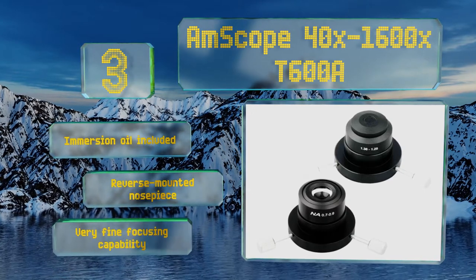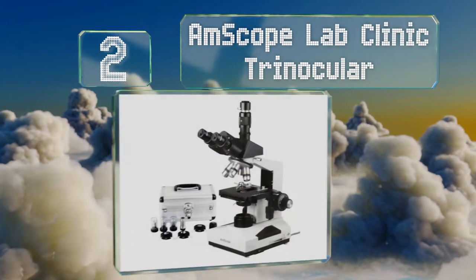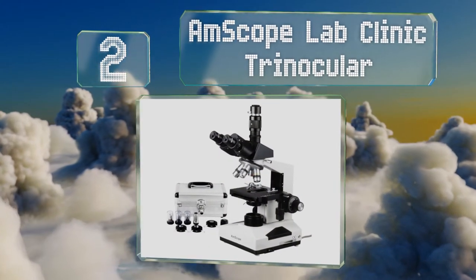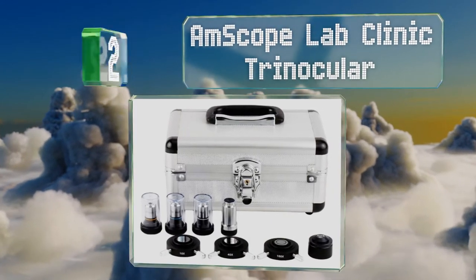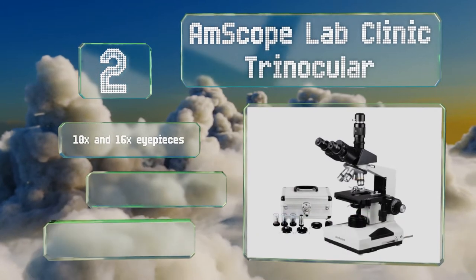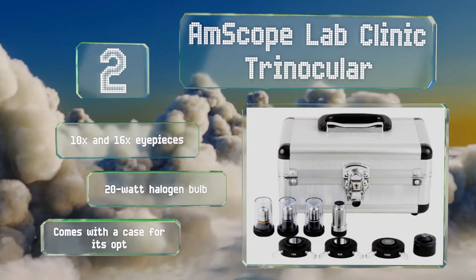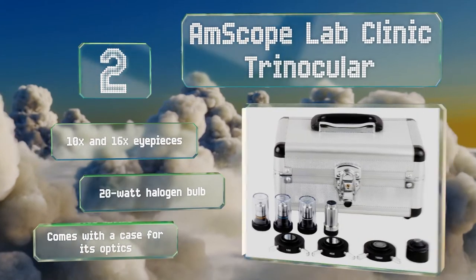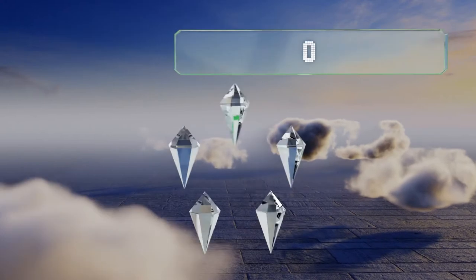At number two, while the AmScope Lab Clinic Trinocular may not be equipped with any photographic capabilities of its own, it does have a port dedicated to the connection of such gear if you happen to own it. Its 3D mechanical stage moves smoothly and with precision. It comes with 10x and 16x eyepieces, a 20-watt halogen bulb, and a case for its optics.